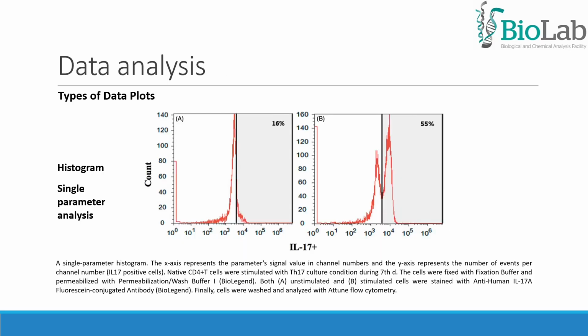Analyzing data is a multi-step process that has been considered as the most critical parameter for biological experiments. In this presentation, I will only talk about the features of the Attune software to analyze data. The Attune cytometric software displays data in histogram, dots, or density plots.